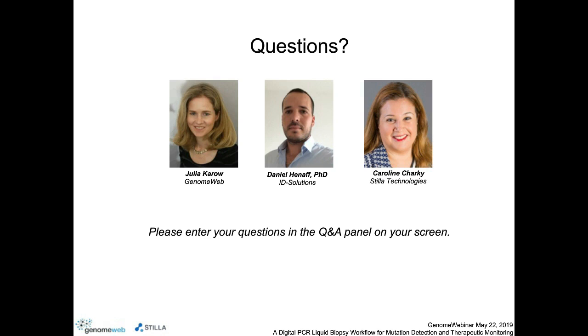A question for Daniel. How long does it actually take to develop a new digital PCR assay? I think you had the workflow for that on slide 29. That's quite difficult to answer, how long it takes to develop. It depends on the complexity of the assays. It can take a few months to up to 1 year, depending on how many targets you need, if you want to discriminate them, if it's only a screening assay.